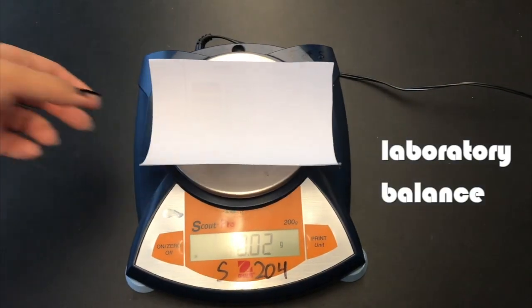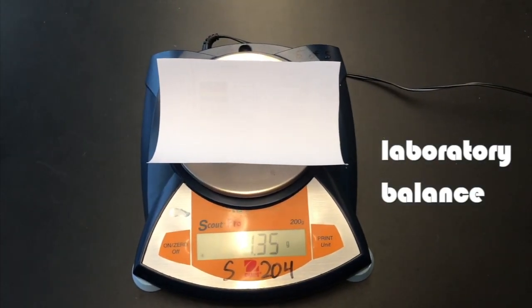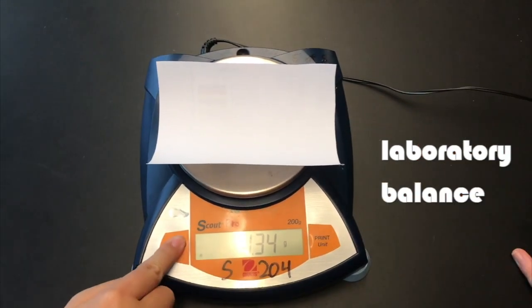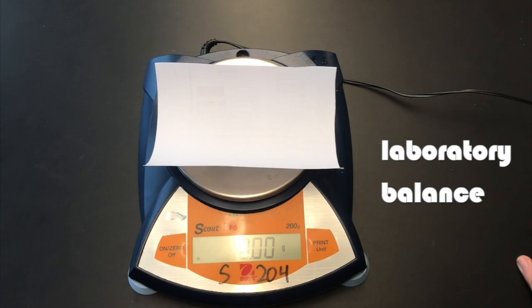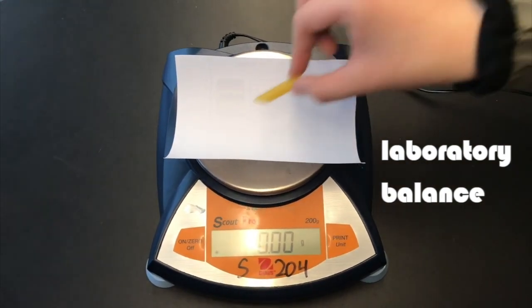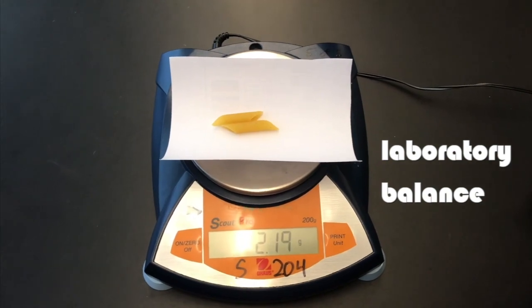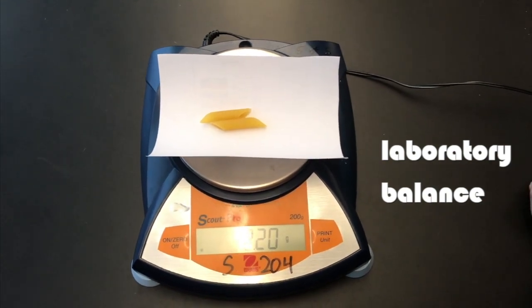To weigh a solid substance, first place a piece of weighing paper on the scale and tare the mass. Do this by pressing the on/0/off button once more, after which the 3 zeros will appear again. Then place the substance onto the weighing paper and record the numbers as shown on the balance.